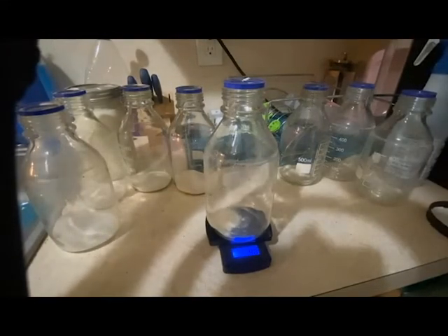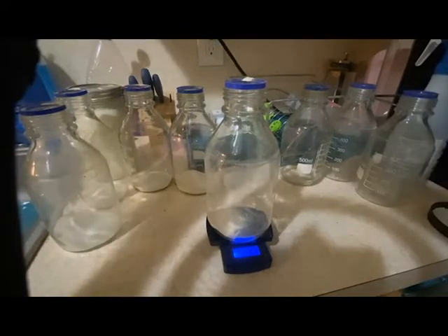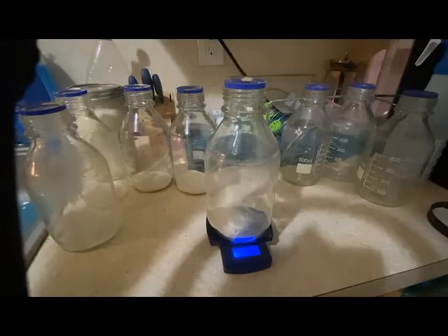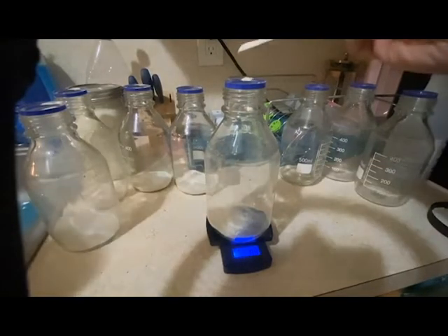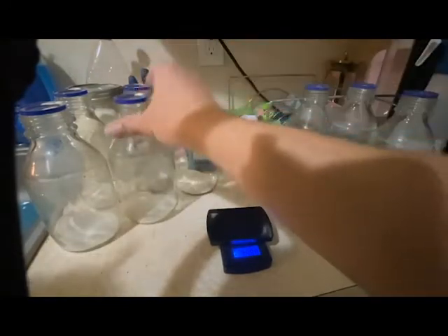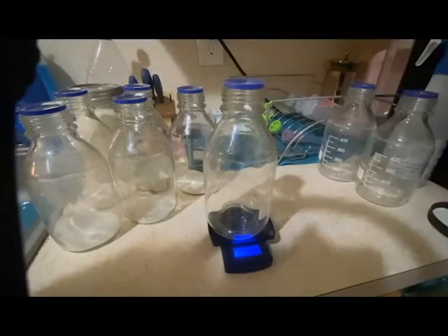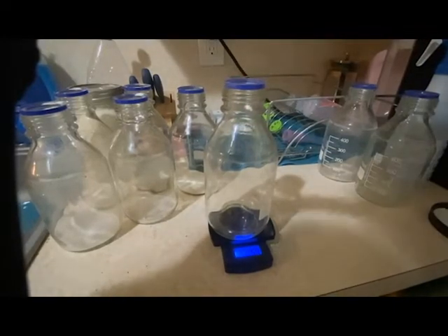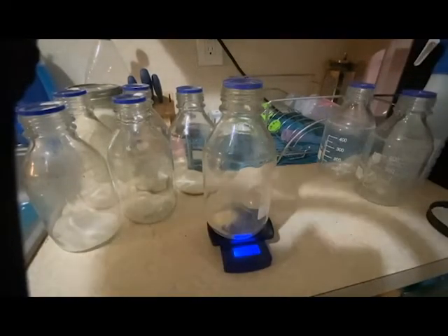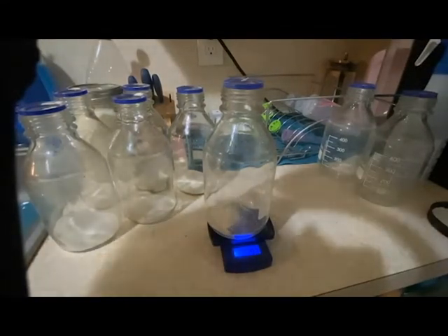When I try to cut it with my scalpel and I pick up a transfer, it doesn't like pop up. It seems really slimy. I'd say 800 milliliters gets me about 30 Petri dishes. With 500 milliliters, you typically would get about 20 Petri dishes if you did it correctly.